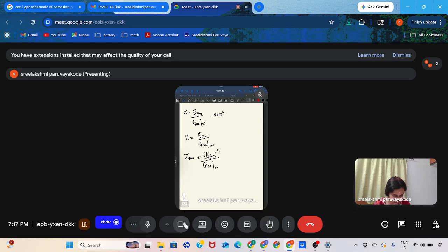This is at higher harmonics, where the n value is equal to 2, but the unit is not ohm centimeter square. So this is the difference that comes when it's non-linear: it is expressed in terms of current. If it was linear, the other equations remain the same. We'll go through the questions directly so that we can have a discussion if required.